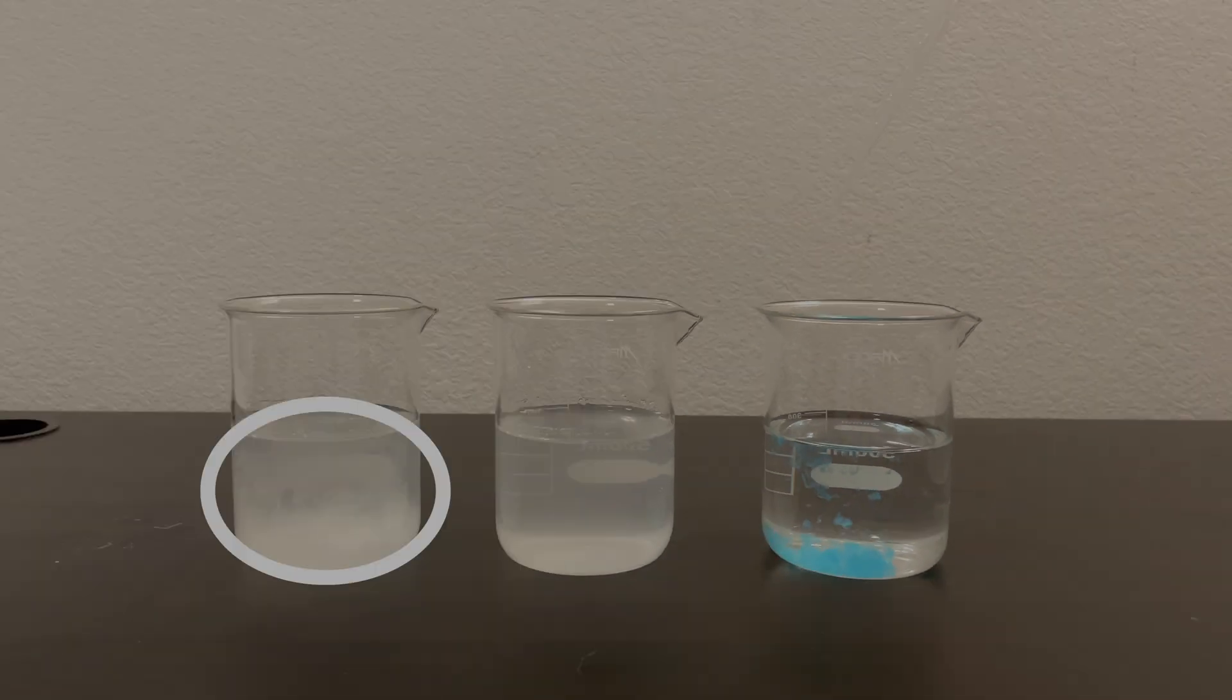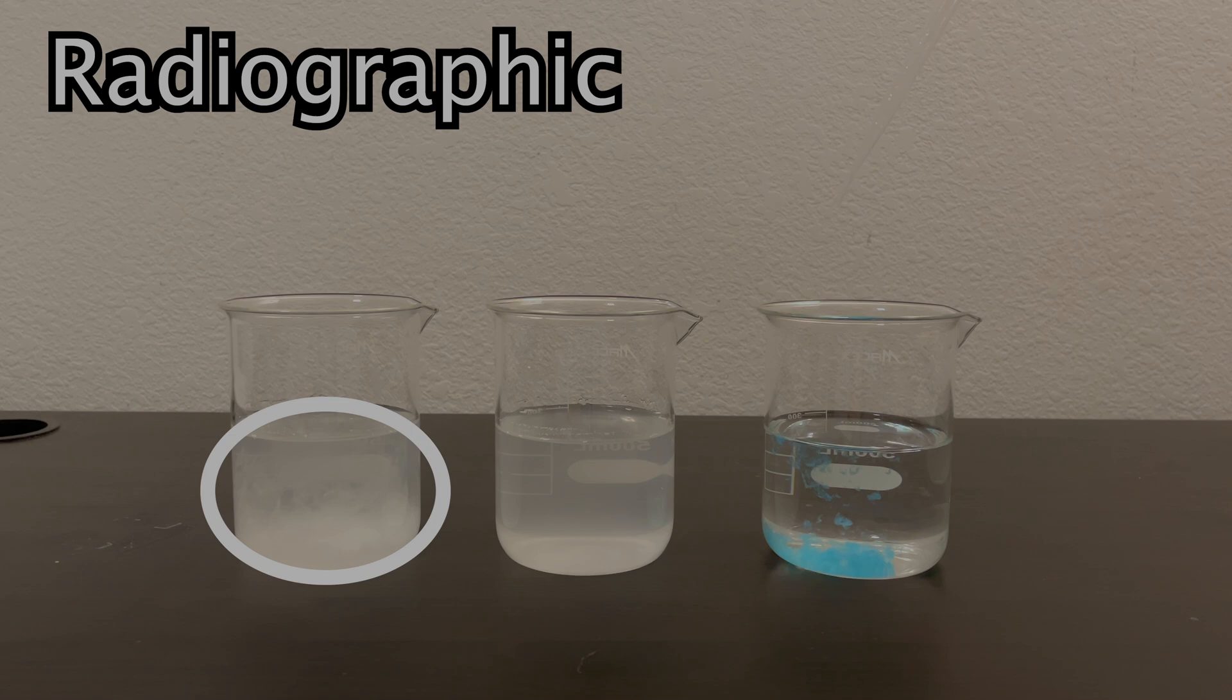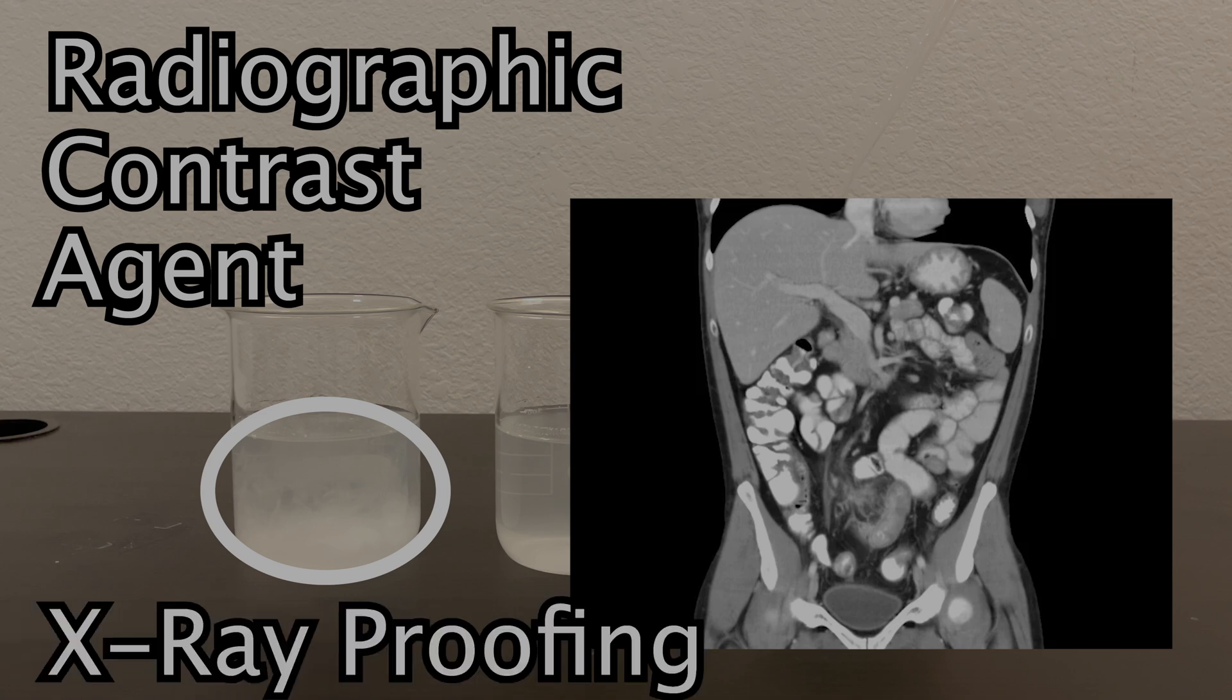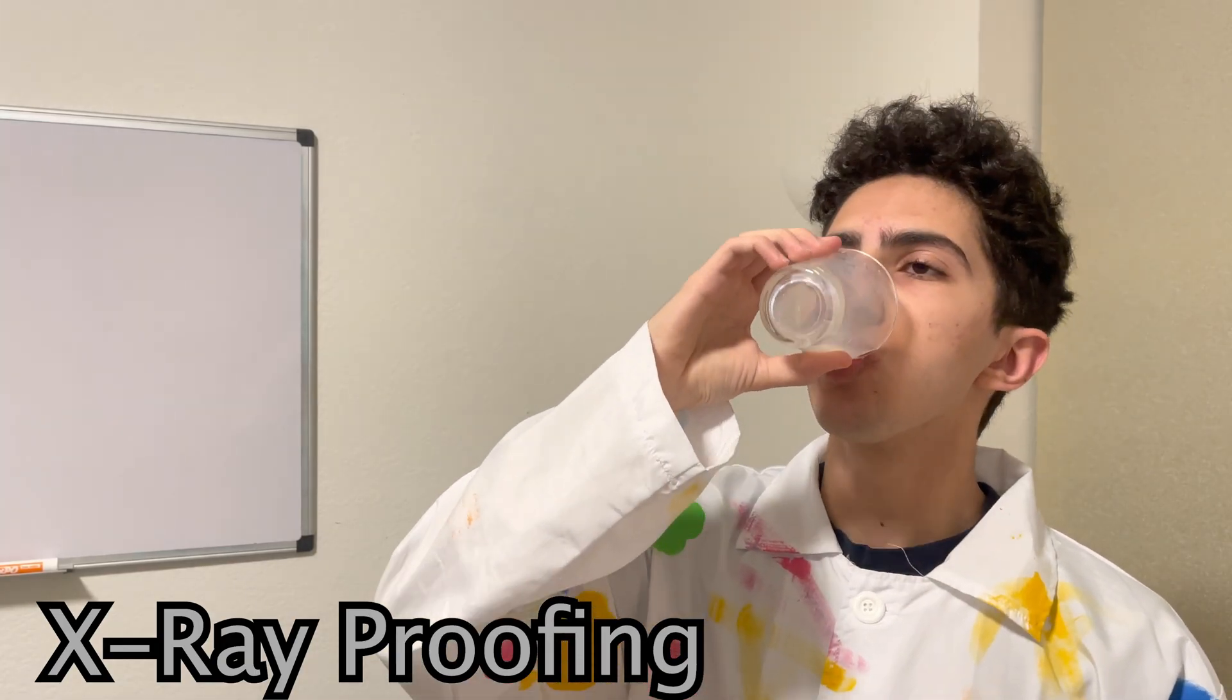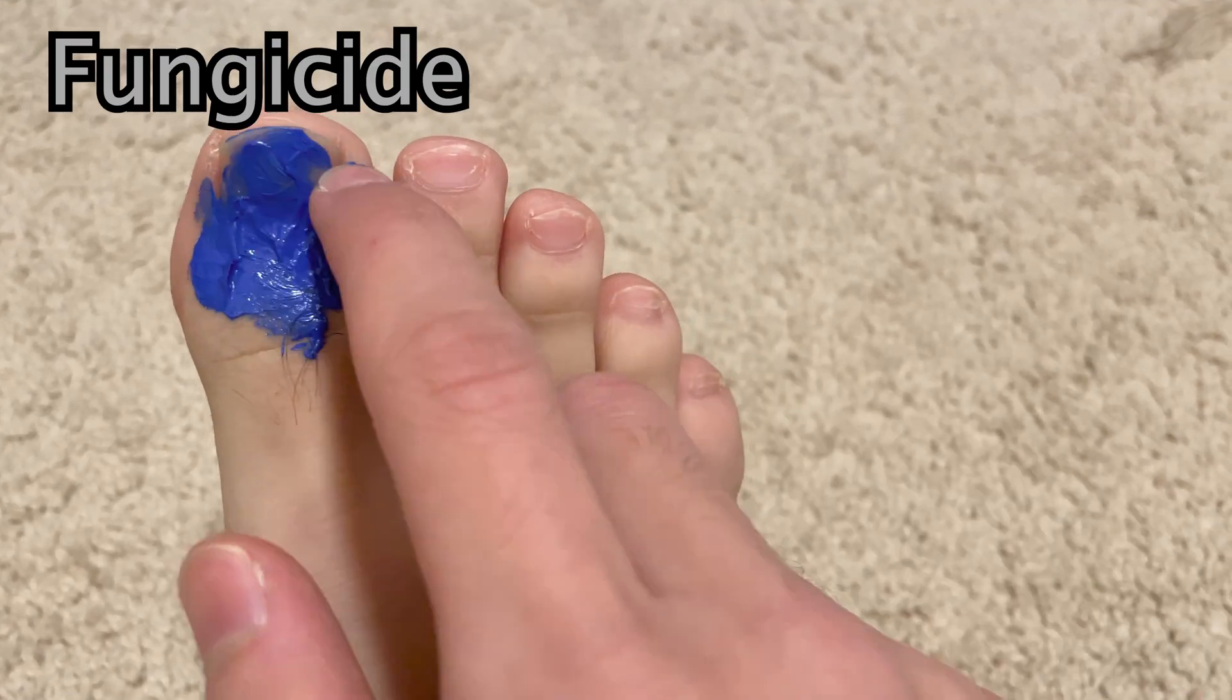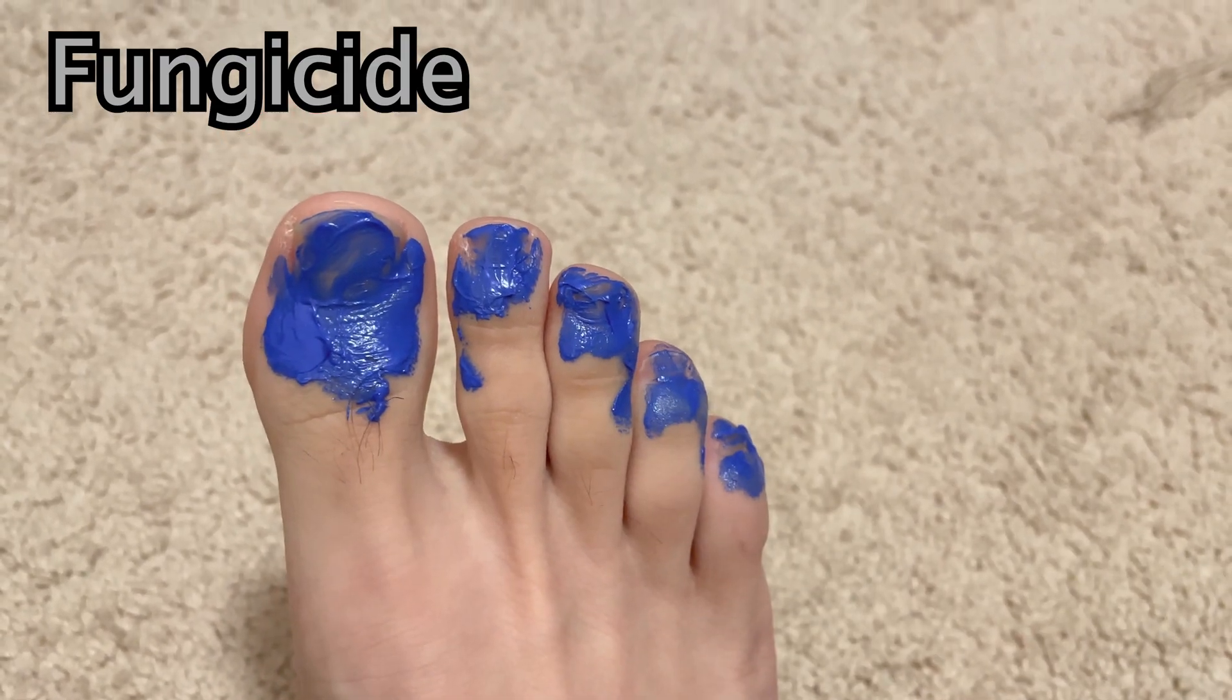Now, this white precipitate is actually a radiographic contrast agent, meaning it's used to enhance CT scans since it shows up better under x-rays. So to become x-ray proof, I drank some of it. This blue precipitate has historically been used as a fungicide, so I rubbed some of it on my feet to cure my foot fungus.